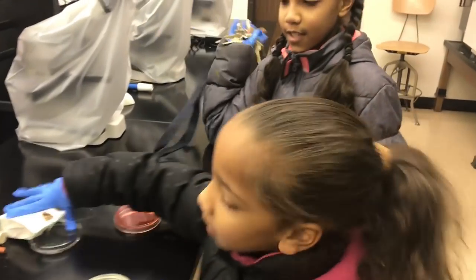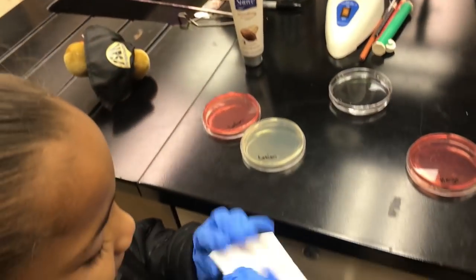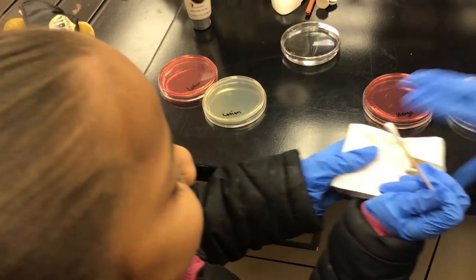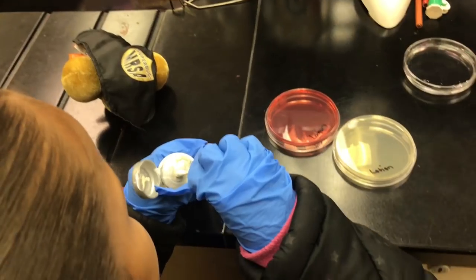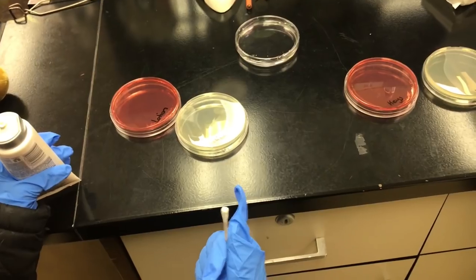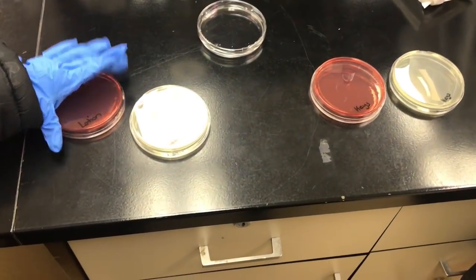I'm gonna be doing the keys. I'm gonna be doing the lotion. Now you almost grabbed the superbug. I'm gonna go get a swab. So you gotta open the lotion, Janaya. Okay, so now you gotta swab it on the plate.